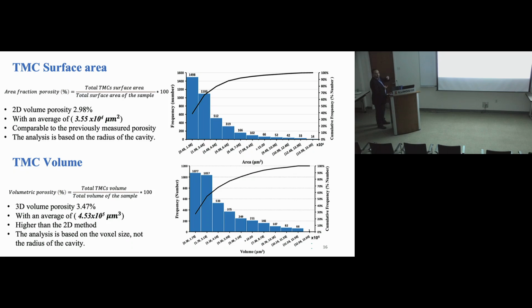This variation can happen because the tubules are not perfect spheres or perfect circles, so the software can measure anywhere. But in 3D, the software calculates based on the voxel size, so it's more accurate.